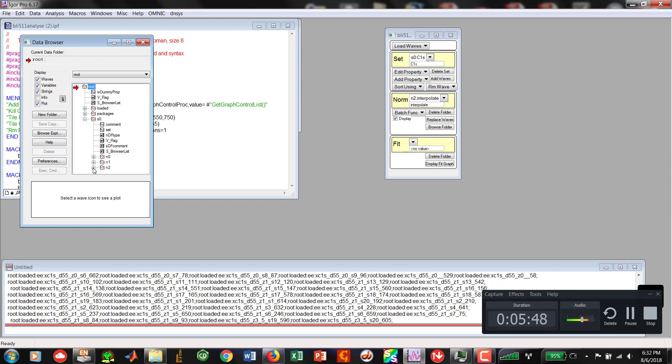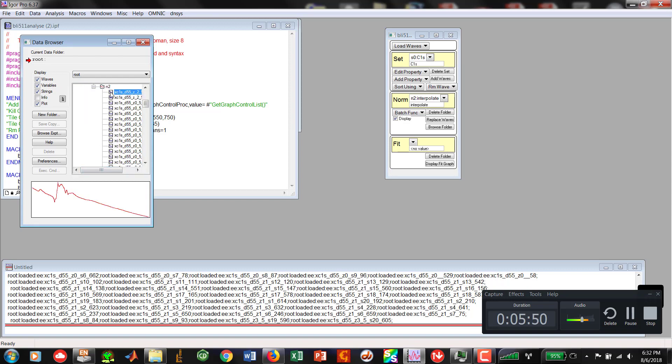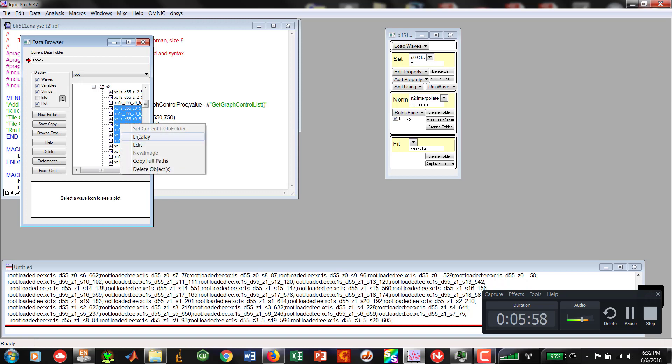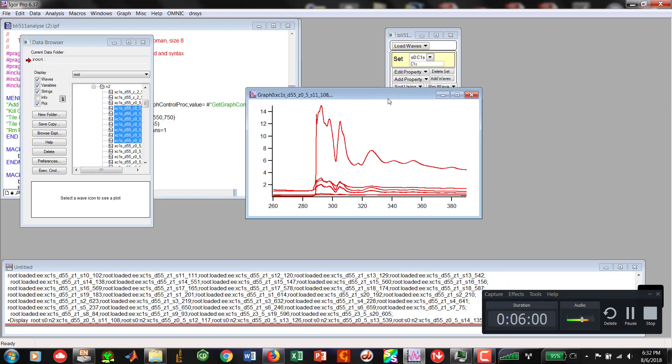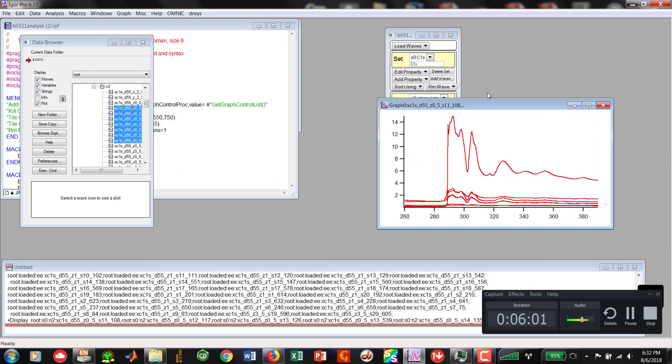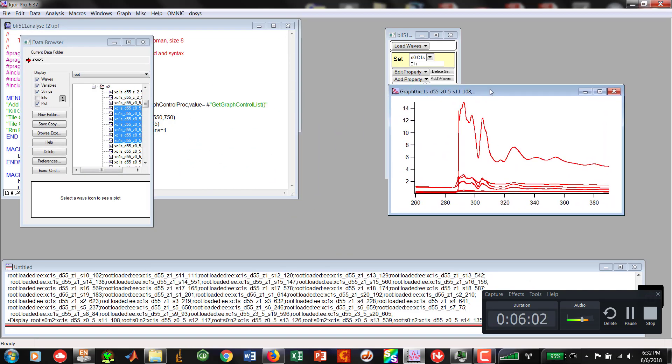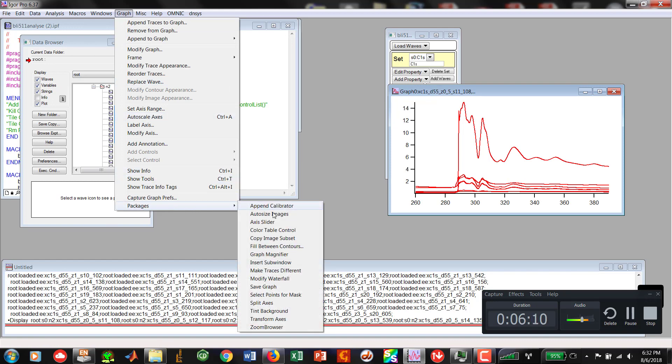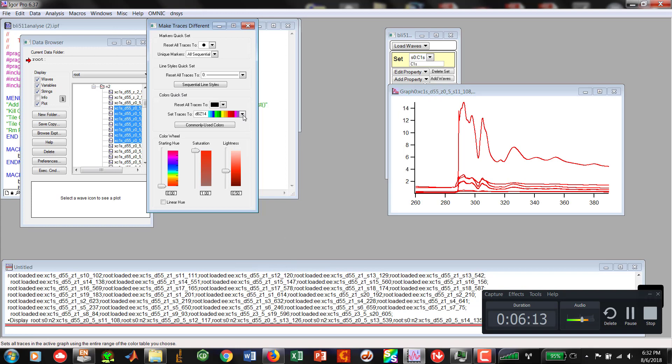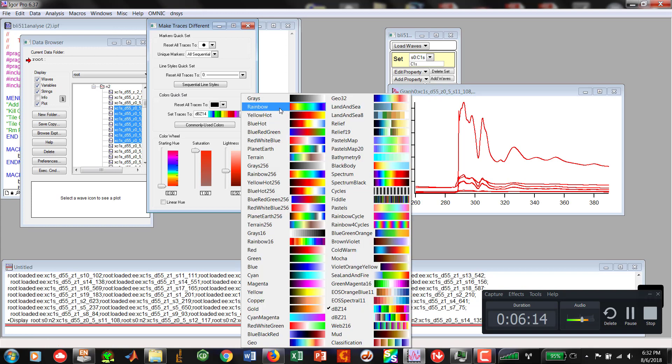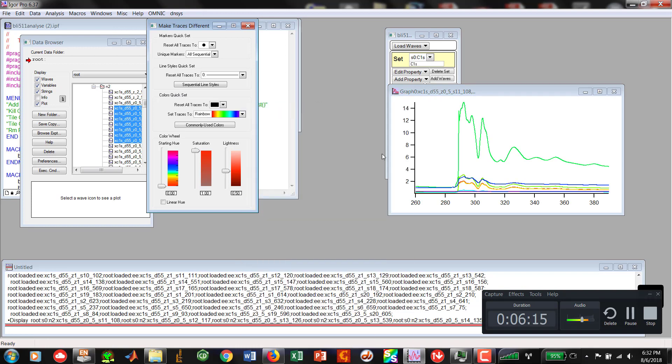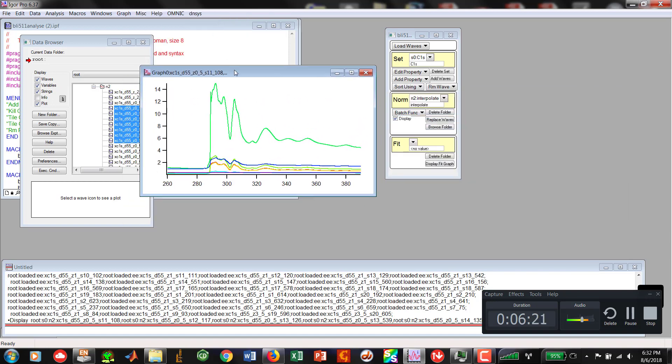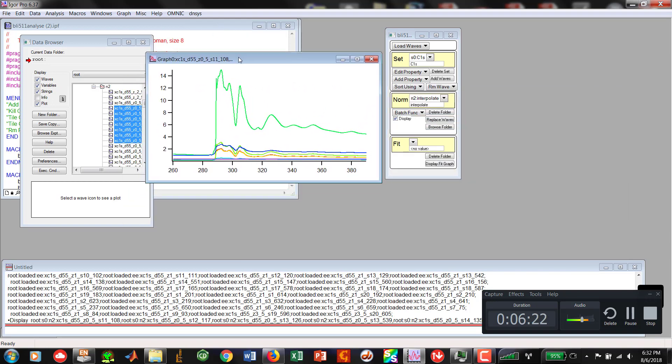Now you'll notice we now have N2. N2 is our interpolated data set. Now what I'm going to do right here is I'm going to click on a couple of these and display them. So you can believe that I actually did the work with the correct X and Y waves. I'm going to go over to graph. I'm going to say packages. And I'm going to say make traces different. I'm going to go into the rainbow mode and we're all rainbowed up. Everything looks pretty. Now we've got interpolated data.